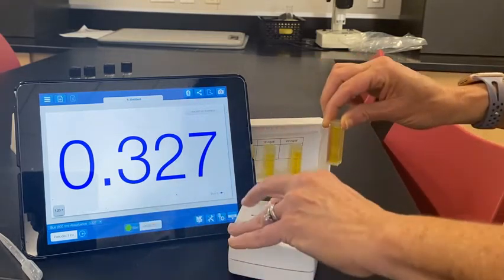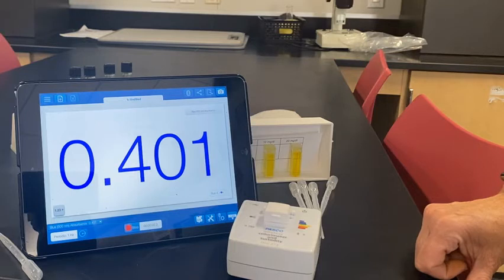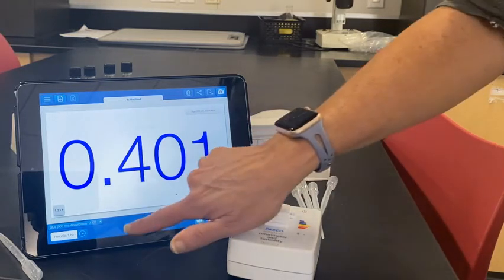You can stop in between readings if you'd like. Be sure to record the percent absorbance for each known sample, and make sure everything aligns correctly with no cross-contamination. Once you've collected all the data and the table is complete, you will then make your standard curve and use it for your patient.